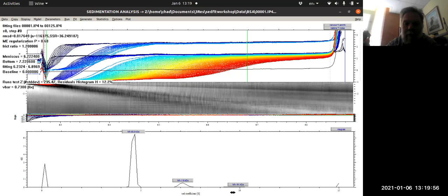And down here is the model. And the model is telling me that if I put something in at about 60 kilodaltons, if I'm reading that right, and something about what looks like it might be a dimer, and maybe even a trimer, then I can see that I can create data that fits my data. I can create a model that fits my data best. Right now, the things you want to pay attention to are these values over here.